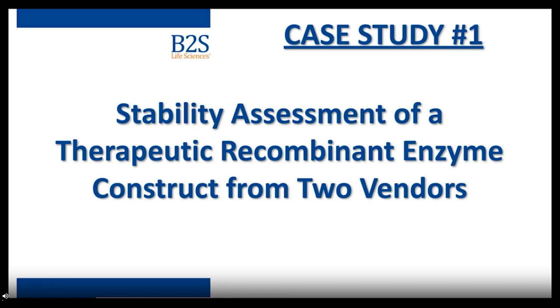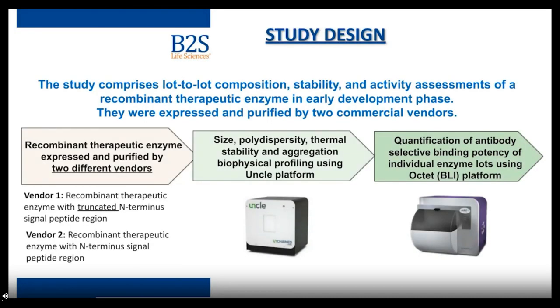So we chose our advanced characterization methods accordingly and gathered data to make our conclusions. On this slide, I present the study design for this case study. We were seeking to learn 3 key things about the enzymes: what the composition, stability, and activity were.